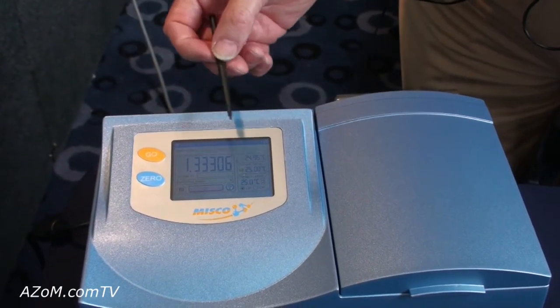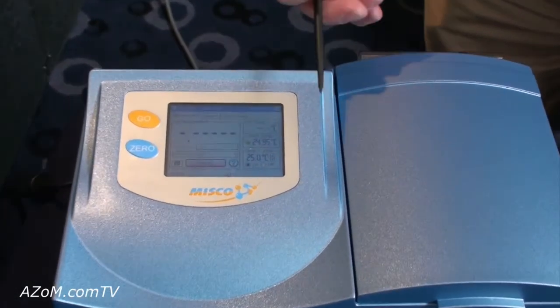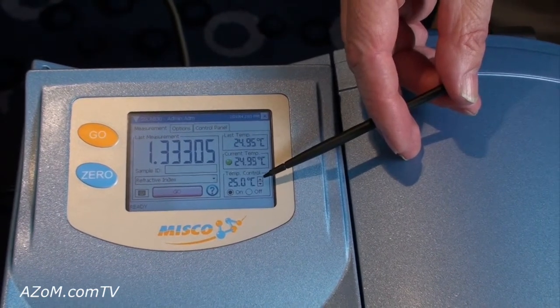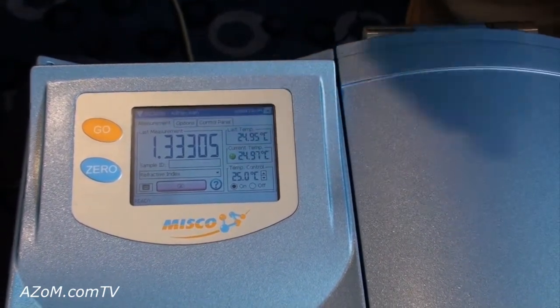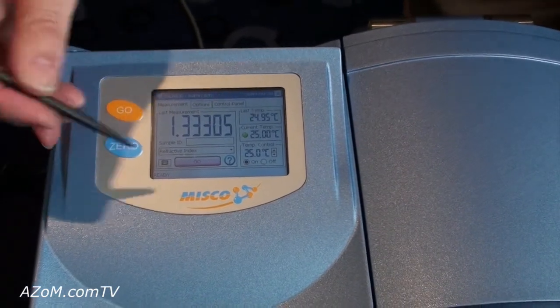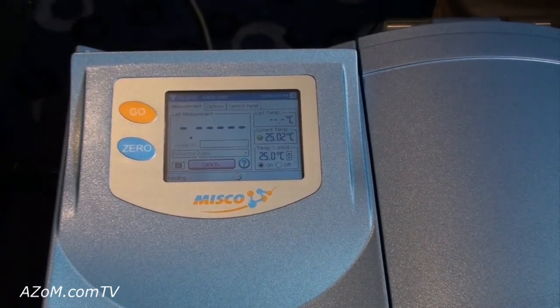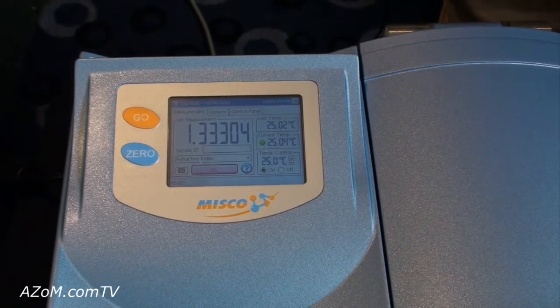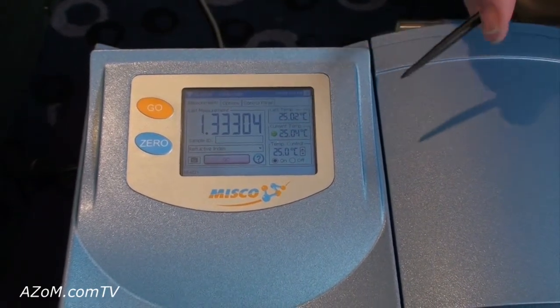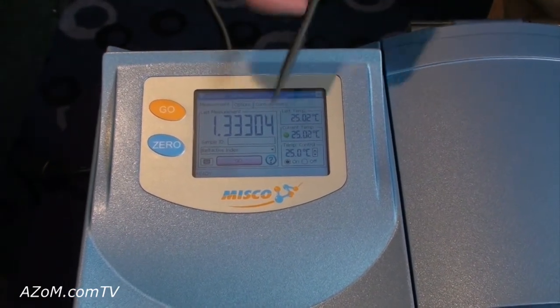To make a measurement, we simply hit the go button and it will check for the temperature to the set temperature. When it's within range it will actually make the reading. 1.33305, plus or minus one digit from the previous answer. Just to prove that it's not an artifact we can do it all again. 1.33304. We're still temperature equilibrating a little bit, as this is a sample I just put in there, so it takes a little while to get down to the second decimal point of temperature. So we have a good reading there.